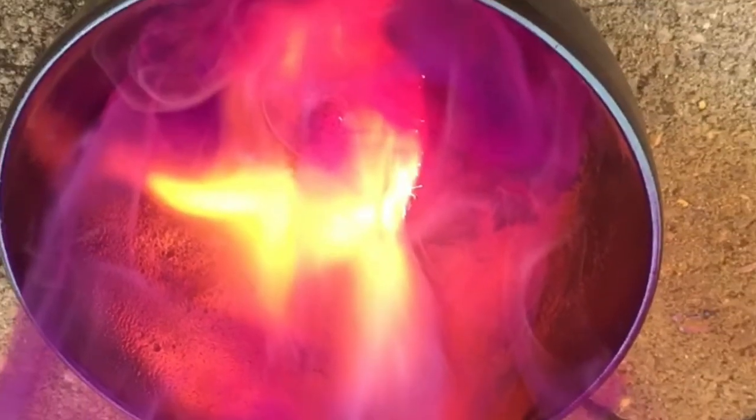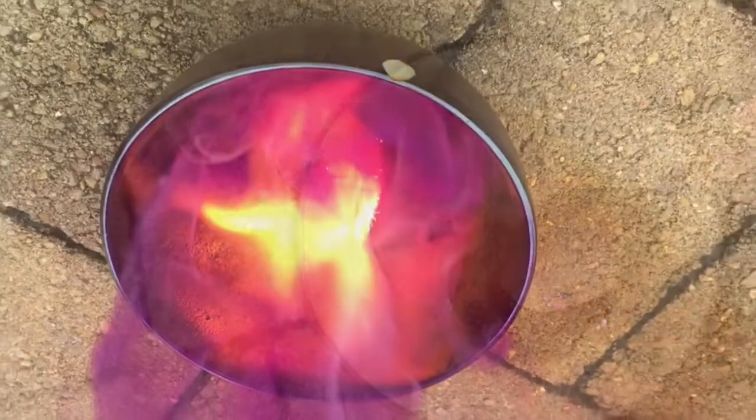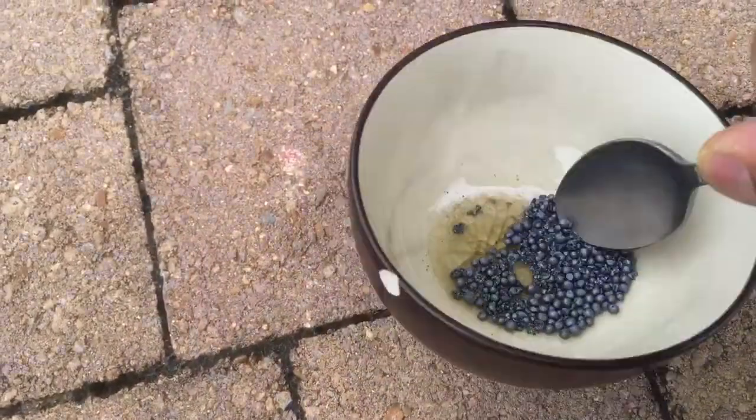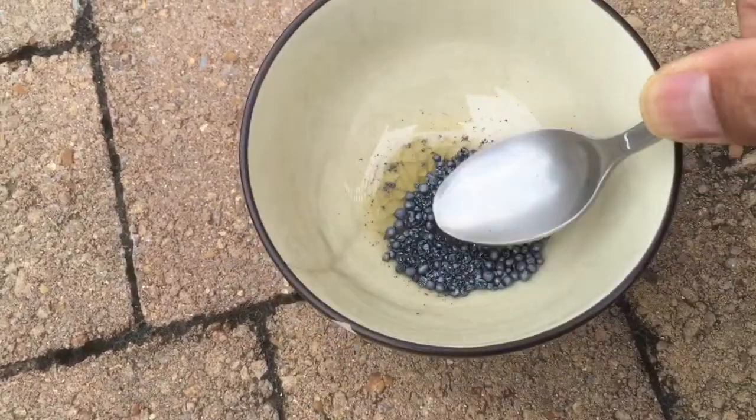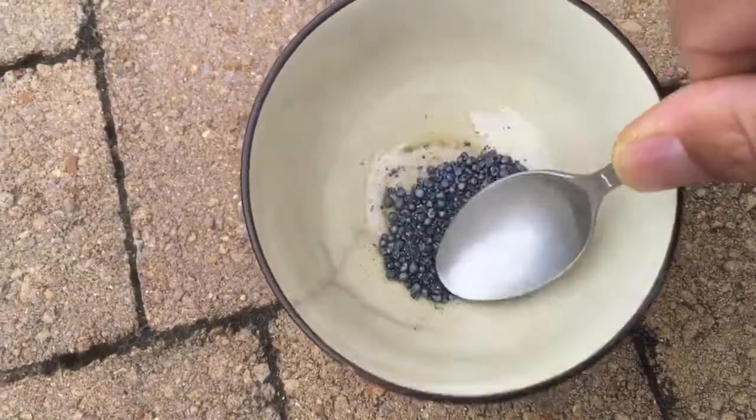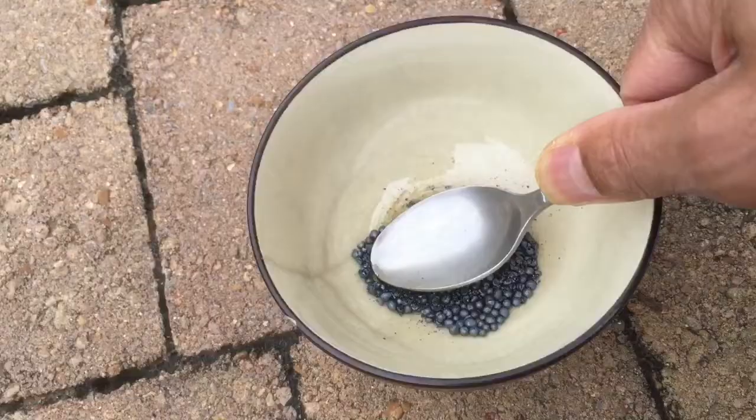In this video I'm going to demonstrate the energetic reaction between aluminum powder and iodine. You want five parts of iodine to one part of aluminum, so what I'm doing here first is grinding up the iodine beads to make a finer powder.